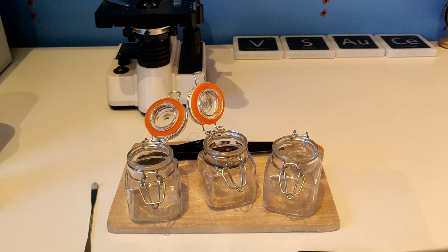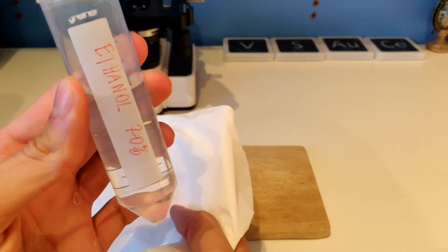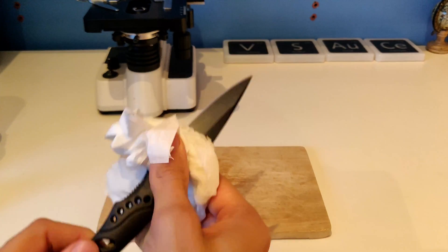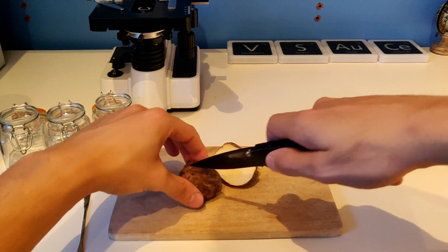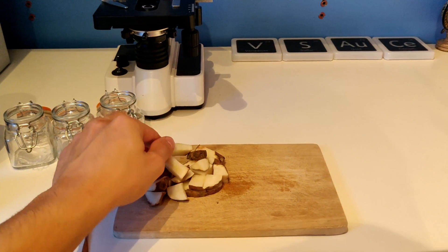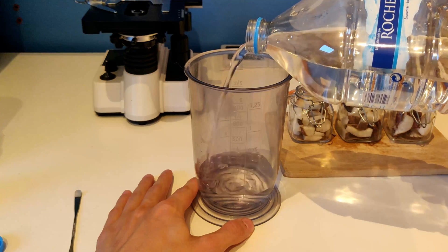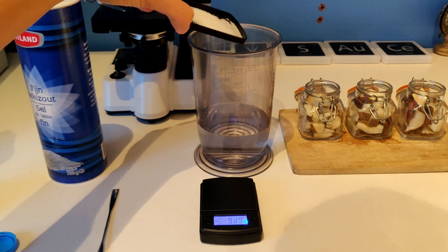I tested a fermentation setup for the presence of any bacteria and potentially some new species. For the fermentation you need a closable jar and something to cut your vegetables with. After cleaning everything with some ethanol, except the vegetables which harbor the bacteria of interest, you cut the vegetables in pieces that fit the jar. I used a Jerusalem artichoke but you can use any vegetable or fruit. You need to squeeze the pieces in place so they won't float when you add your salt solution. Next I had to make the 2% salt solution, so I added 5 grams of salt to 250 ml of water.